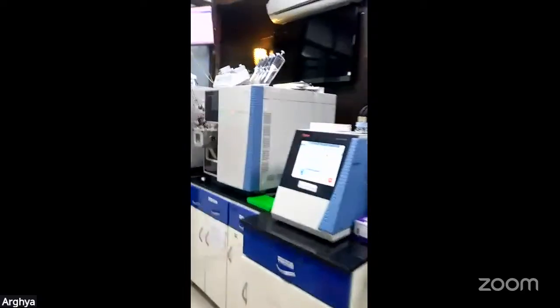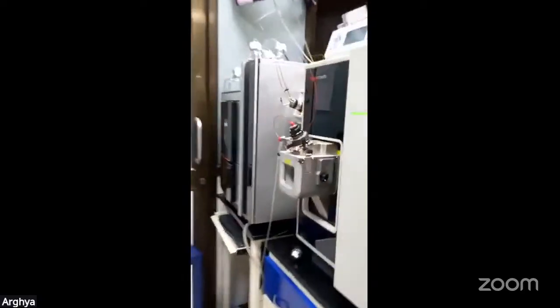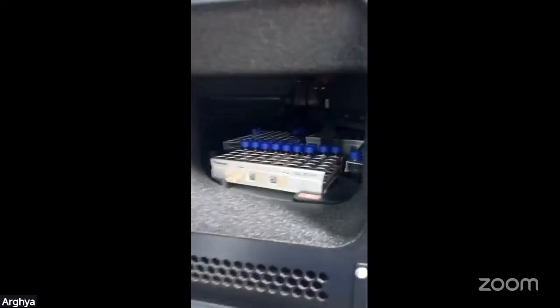One more mass spec that can be used is the triple quadrupole series. These mass specs are generally used for the validation of the interactors or the bait or the interaction. So this is a Thermo Vanquish UHPLC. The samples can be loaded into the sample compartment here. So this is the sample compartment region.